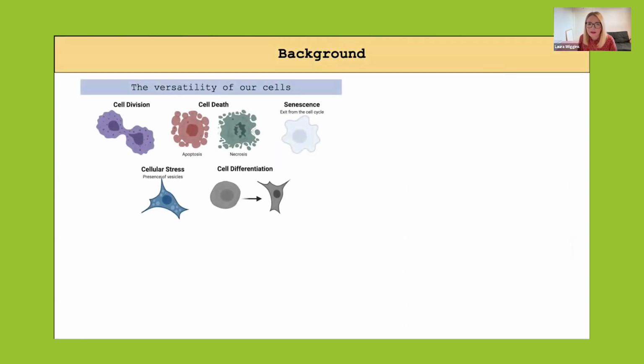So I think one thing that we can all agree on is that our cells are very versatile. They're able to adapt to their surroundings, they can respond to environmental cues, they can communicate with one another and coordinate their actions to achieve certain goals. But they also possess this remarkable ability to resist treatment and to differentiate into different cell types so that they can achieve different functions. And we can gain a lot from techniques from genomics, transcriptomics, and proteomics to characterize these cellular processes in detail.